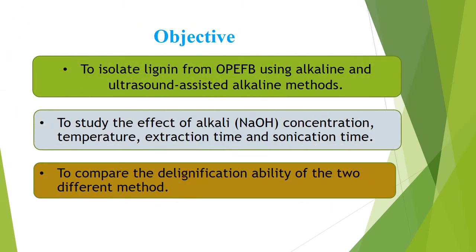Objective. The objective is to isolate lignin from oil palm empty fruit bunch using alkaline and ultrasound-assisted alkaline methods. To study the effect of alkali concentration, temperature, extraction time, and sonication time. To compare the delignification ability of the two different methods.